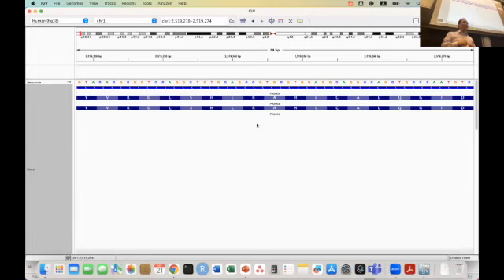And all of them, not just one. Codon GGC and TGC code for the amino acid A, right? Okay. Now let me. Are you sure TGC really codes for the amino acid A?